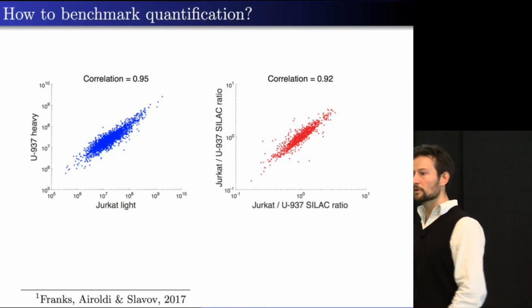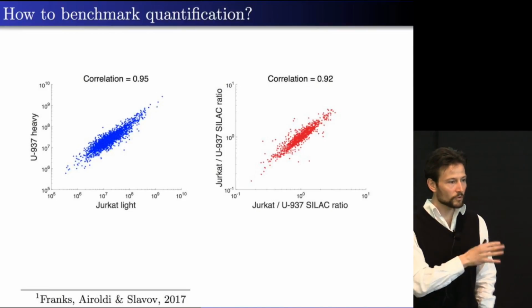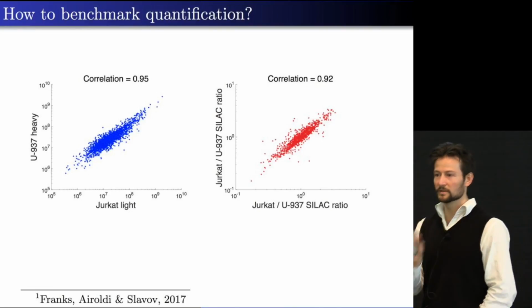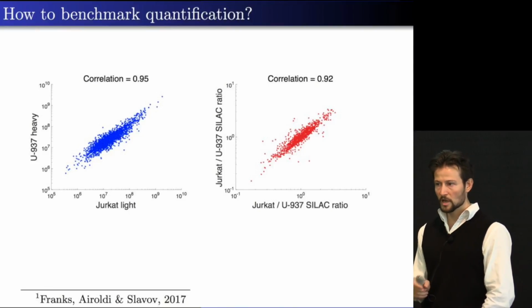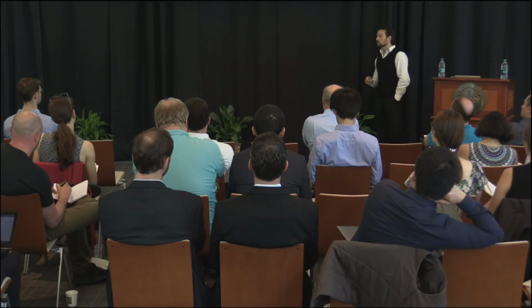If you dig into the supplementary information of the human proteome map papers, you're going to find that too, that if you correlate the proteomes of just about any tissue, they correlate highly. Erythrocytes are an example. You can probably find a few other examples that would deviate, but most of the cells would show this. And if we want to benchmark relative quantitation, we should zero in onto relative quantitation. This, by the way, is, again, the same Simpson paradox that statisticians have described a long time ago. And nonetheless, many people fall prey to that fallacy.